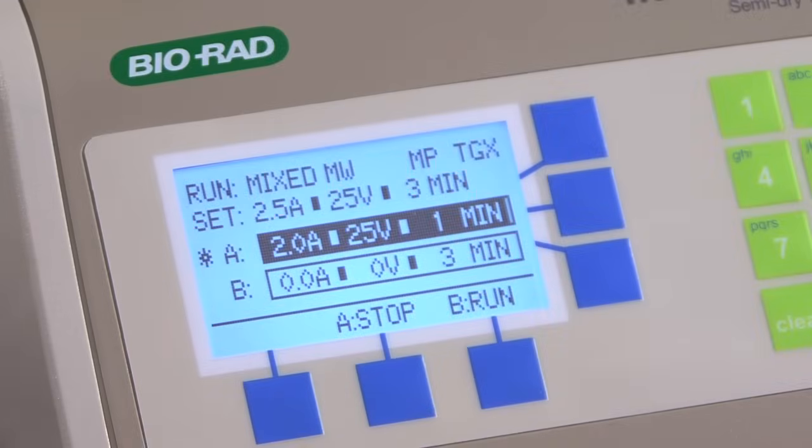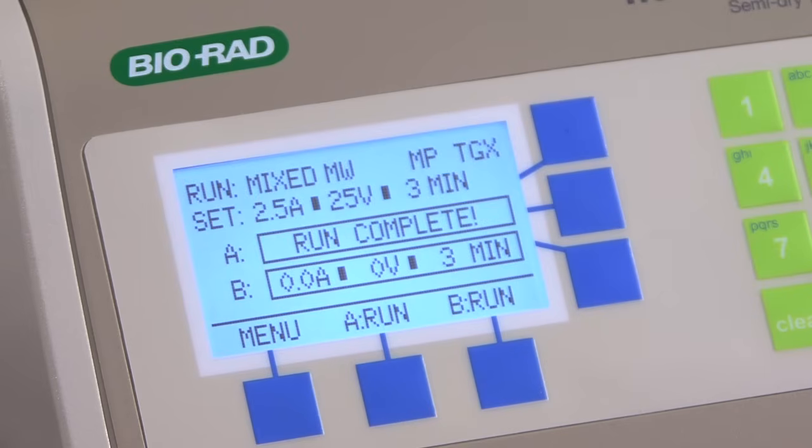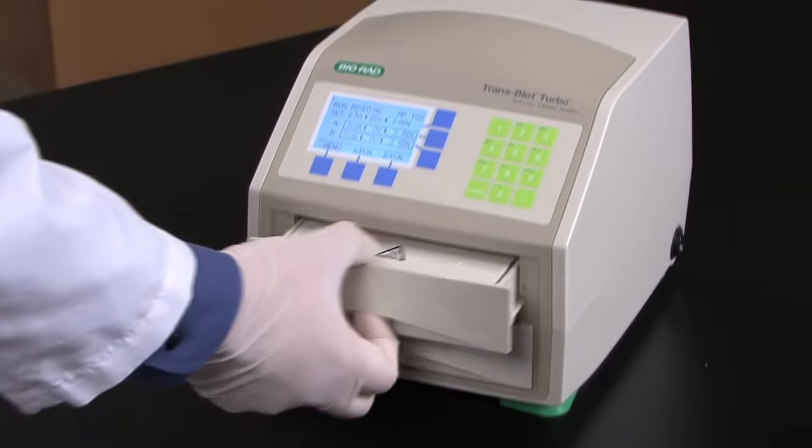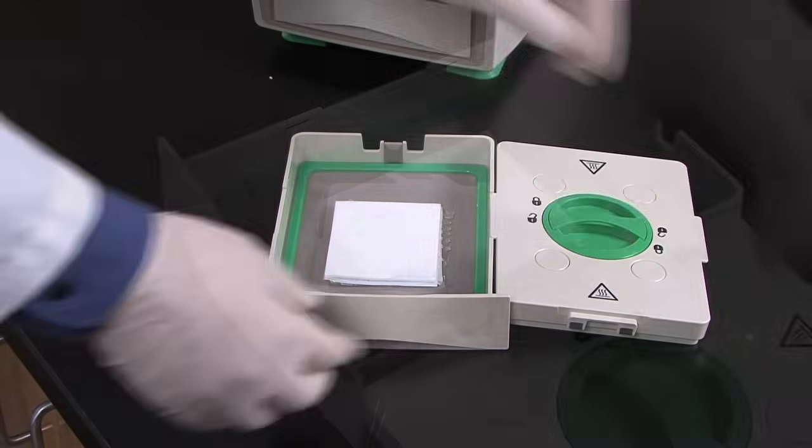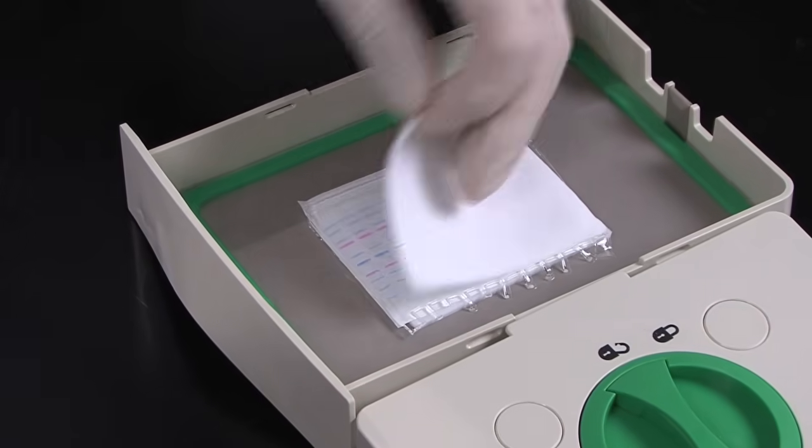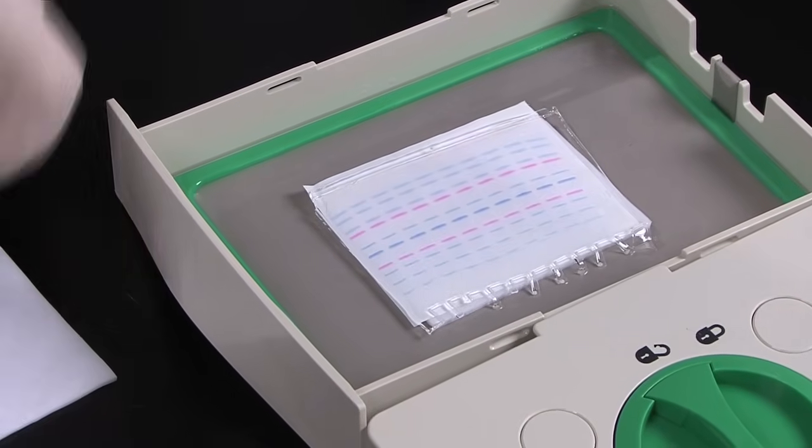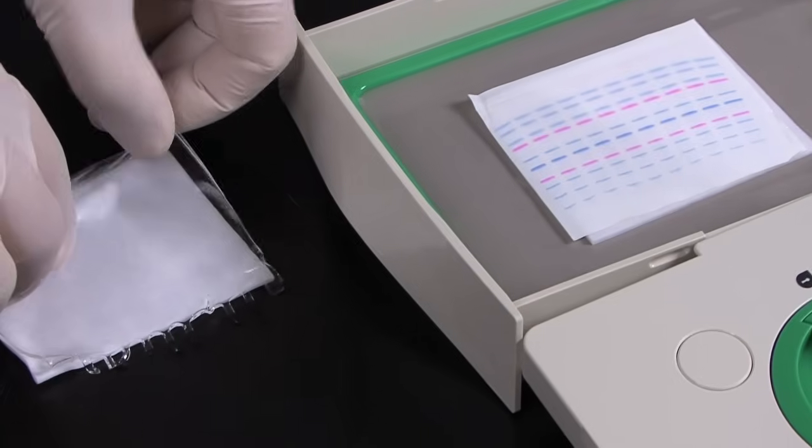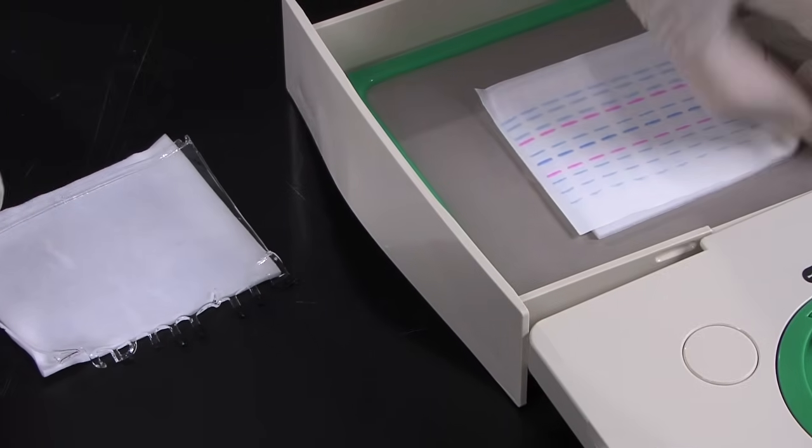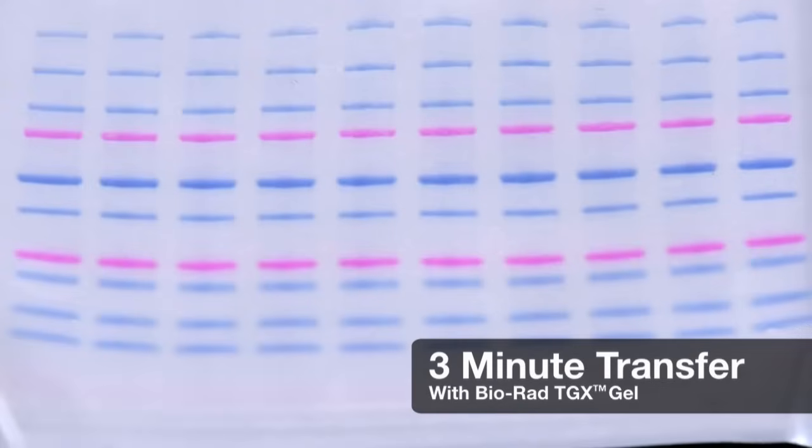After the run is complete, the unit will emit a beep, and Run Complete will be displayed on the LCD screen. The blot does not have to be taken out immediately, though we do recommend proceeding with blot detection as soon as is convenient. Once the transfer is complete, the cassette can be removed from the unit and opened. First, remove the top stack and reveal the transferred blot. Even with the run time as short as 3 minutes, the trans-blot turbo produces excellent results.